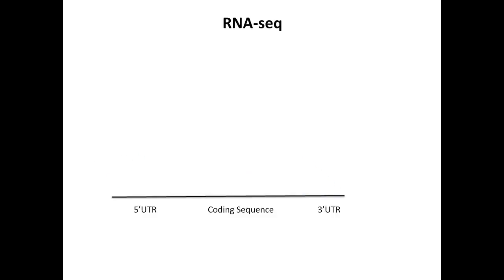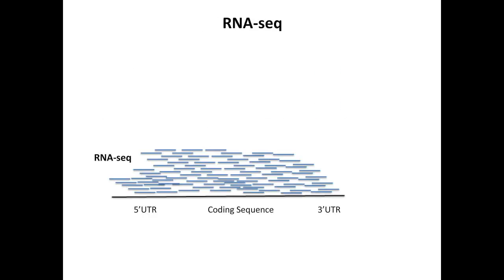But if you compare RNA-seq with 3' RNA-seq, here you can see that in 3' RNA-seq, we don't sequence the full transcript, but we focus on the right-hand side. You can see 3' UTR. We only sequence 100 base pairs from the 3' UTR, and we use this information to quantify gene expression. So if we count all these transcripts one by one, we could quantify expression of the gene.